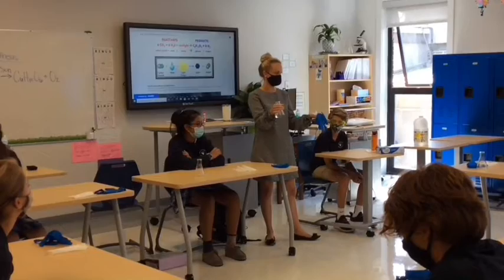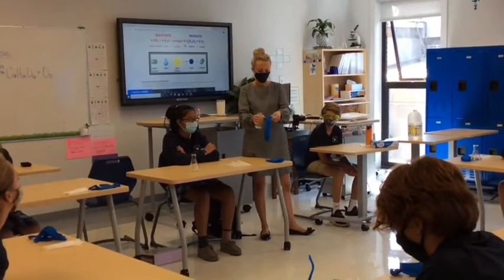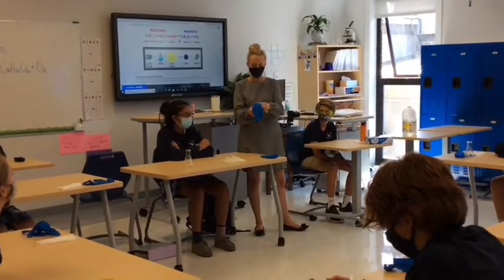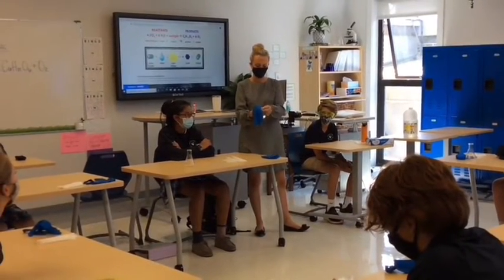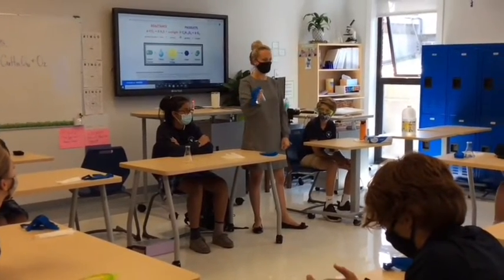Will anything happen if it drips on the floor? You have to clean it up — we have to clean it up and it's going to smell. That's it. You are going to put the glove and leave a lot of room. You don't want to put it too low. So if you're holding on to it, what do we do next?